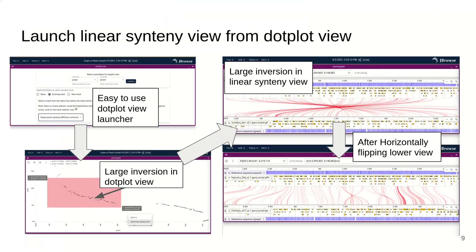Now I'll focus on some of the synteny and comparative genomics features. One of the big features of JBrowse2 is our ability to load data from multiple organisms in a single instance. In this example, I'm going to show grape versus peach. We have an easy-to-use dot plot view launcher where you can select grape and peach and then select the synteny track you want to use. I load some MC scan data — on the y-axis we have grape, on the x-axis we have peach — and there's a large inversion with some smaller features inside it.